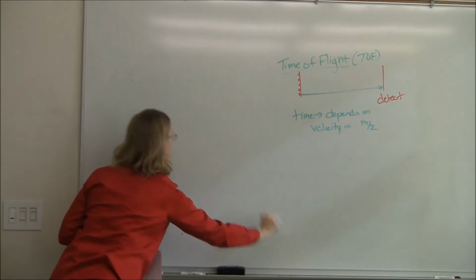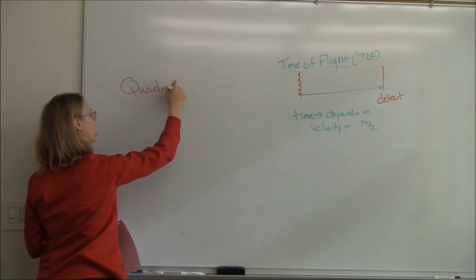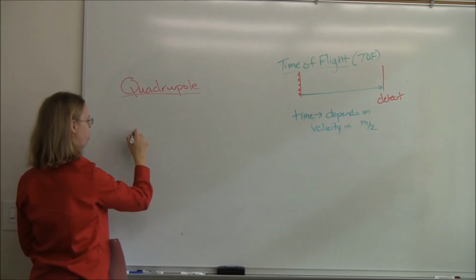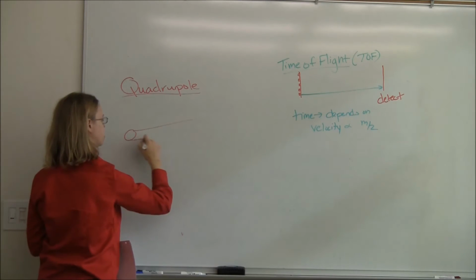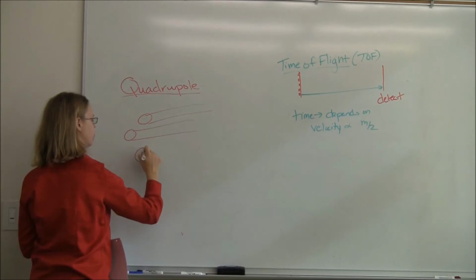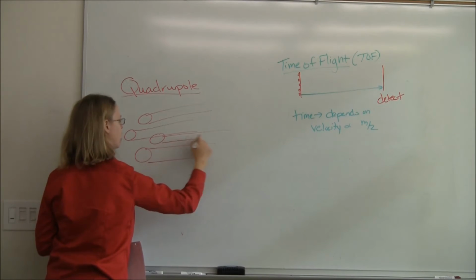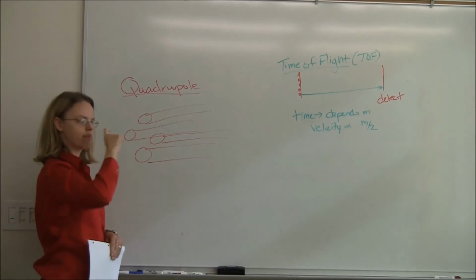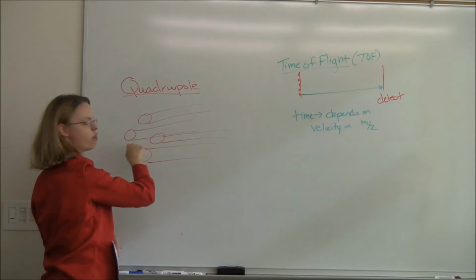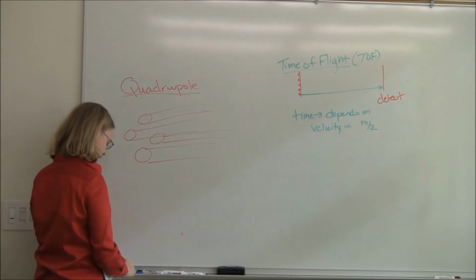This one uses a little bit more physics. Okay, so imagine 4 poles. I'll put a diagram up of this because I draw it pretty poorly, quite frankly. But imagine 4 poles, literally metal rods going back, with 2 on the top going down and 2 on the sides going down. It's really hard to draw, but we have 4, kind of diamond shaped. Think about it like that, metal rods going back.